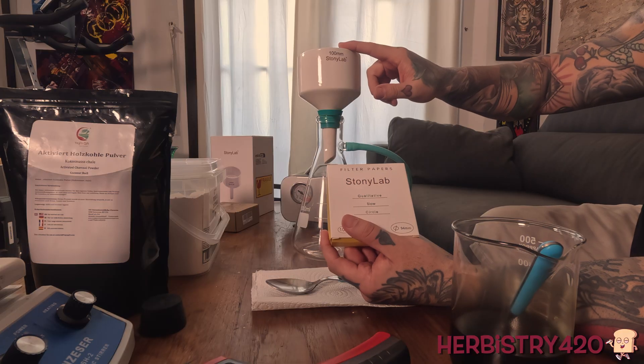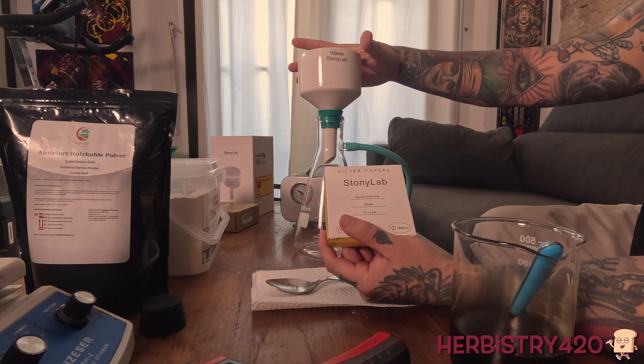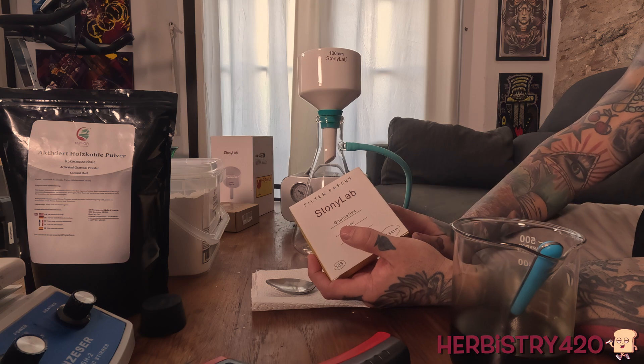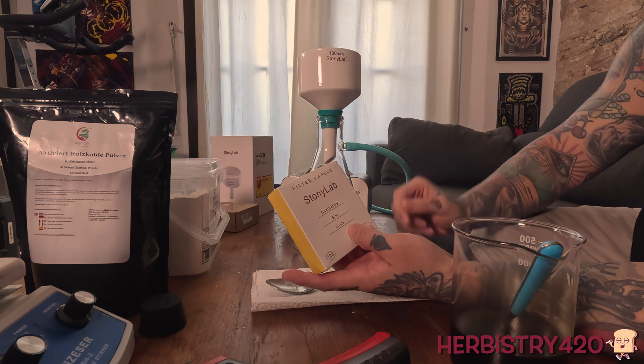So this is the correct one to get for this particular Buchner funnel. However, if you've got a bigger one — this is a hundred millimeters — you could get 120, or even 150. However, then you'd have to get a bigger flask. So make sure you get the one that works with the right flask.